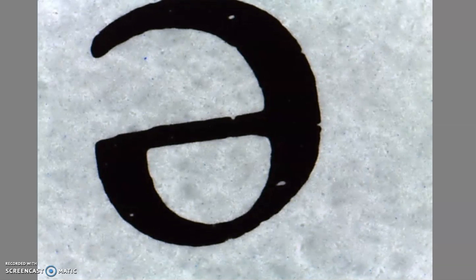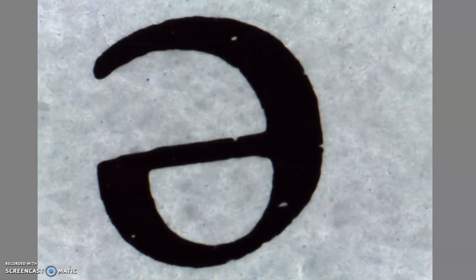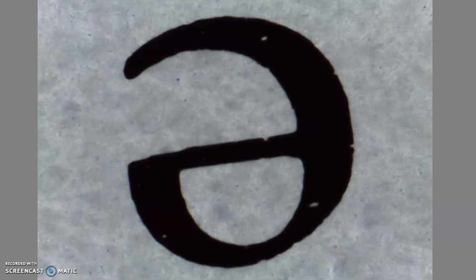Now what you'll notice is the E is basically still in the center, right? And it's a little bit blurry. It got a little blurrier as we moved up. So you are going to want to, again, use the fine focus. I move the fine focus one way, it gets blurrier. You move it back the other way, and it should get a little more clear. So the E now is more zoomed in. We can see it. It's still inverted. Now once you get here, you are going to put it as close to the center of your view as you can. So here we're centered.